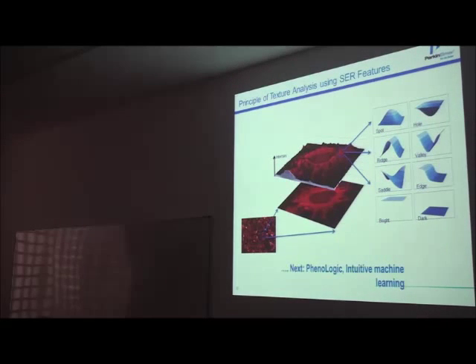How texture works is, if you take this image and zoom in on this cell, and then plot the intensity in Z, you have a kind of landscape of the intensity. What the texture will do is look across a group of pixels, called the kernel here. You can define the kernel in the software. And it will look at the distribution of the intensity. We have spot, hole, ridge, valley, saddle, and so on. This is what the system will look at.